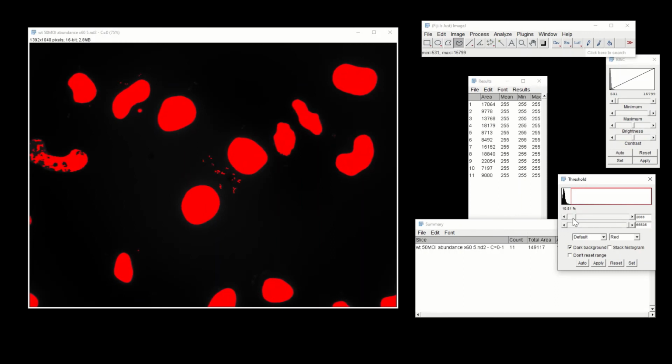Okay, so this is doing a decent job. You can see that it highlighted all of these ones, but it's still missing these guys over here, and it's missing those guys over there as well. So maybe now it's a little better. Okay, so maybe somewhere in between. You know what, this looks like a good compromise. So you can see that the more I drag this slider to the left, the more of these features I see. But on the other hand, the bigger these guys become. And so right here, for example, if I remove this slider, you can see that you actually have a couple of bacteria over here. But when I drag the slider all the way down, you lose that information.